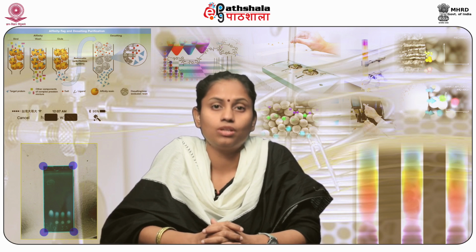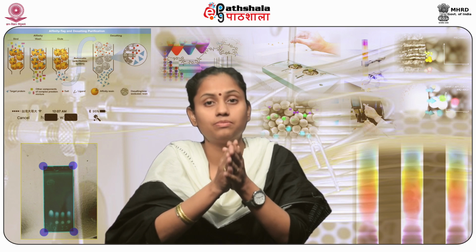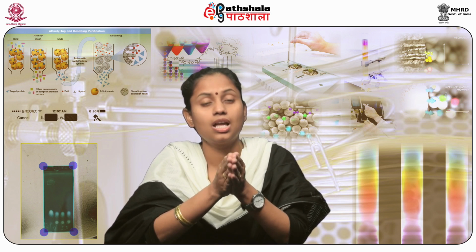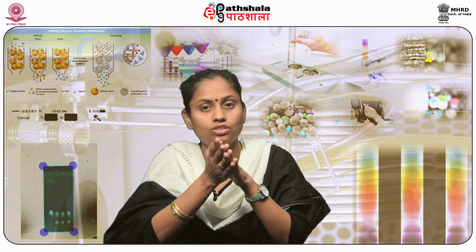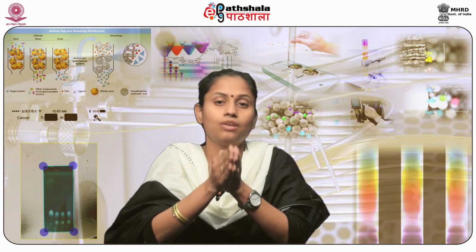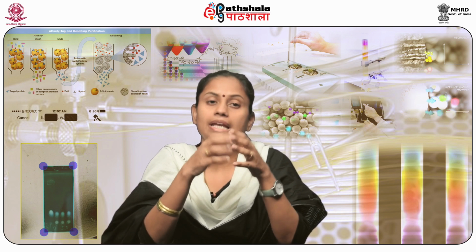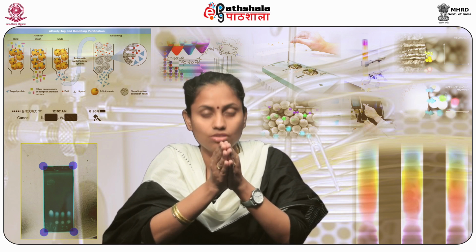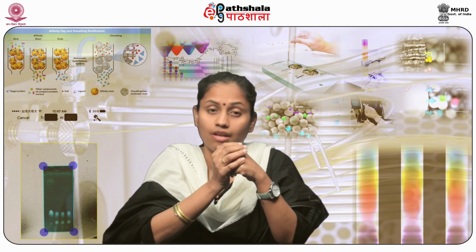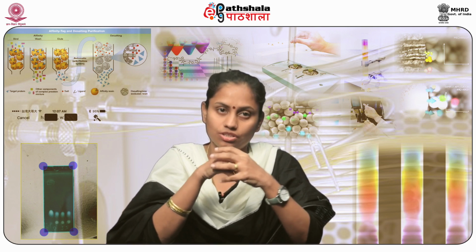So students, in the end, after going through the module, it is time to summarize what we have learned in this module. Ion exchange chromatography is based on the principle of separation on the basis of net surface charge of the molecules. Now, there are two types of ion exchange chromatography which we have learned. It can be cationic and anionic, which is again dependent on the type of resin that we use. In cationic exchanger, the stationary phase or the matrix is negatively charged, whereas in anionic exchanger, it is the reverse, that is, it is positively charged.